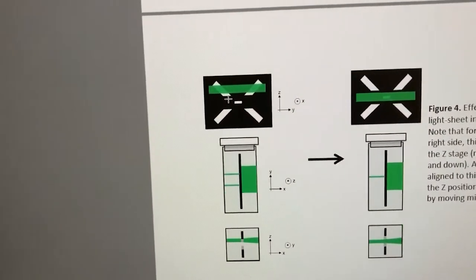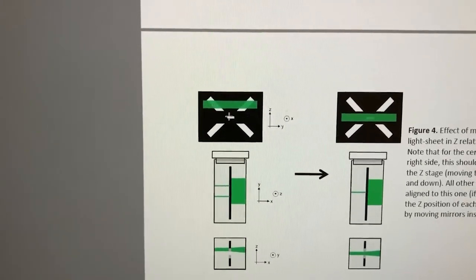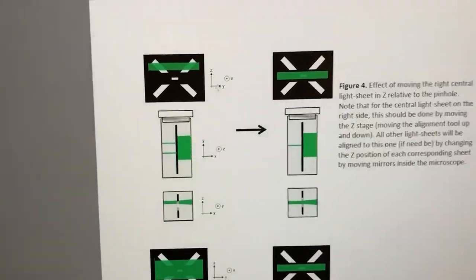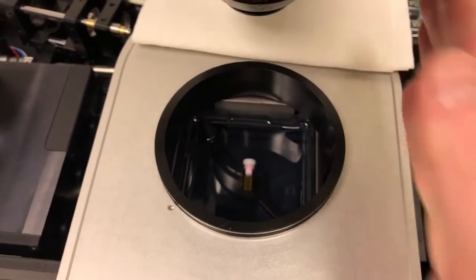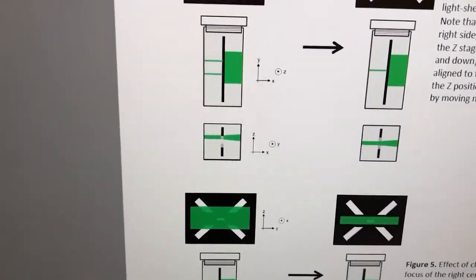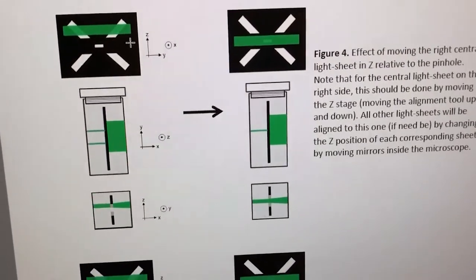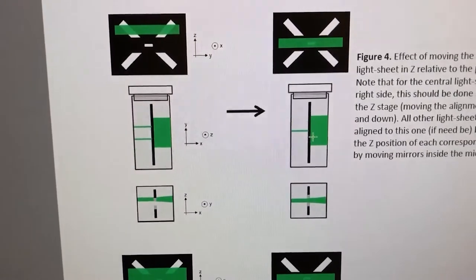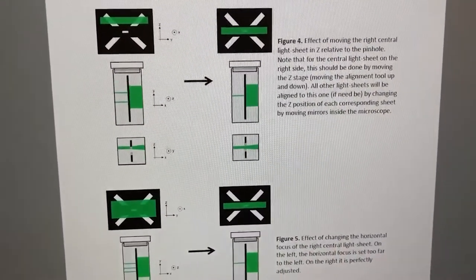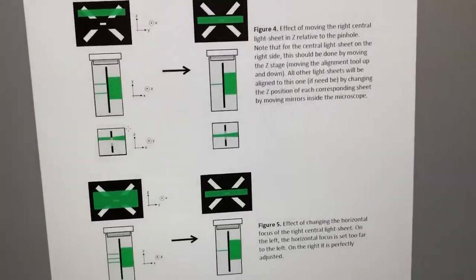The reason for that: if we're completely outside the calibration tool, it doesn't block — we see the whole sheet going through. But if we're blocked by the metal piece, we see two lines. This is a Z-Y view looking at the cuvette from the side. When we're in that position we see two lines; if we move in Z until we intersect the sheet with the calibration hole, we see one line. So: two lines means we're not centered in Z; one line means we are. This is the basis of our alignment.